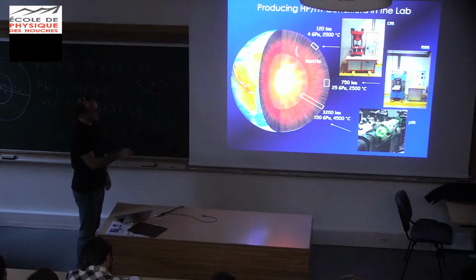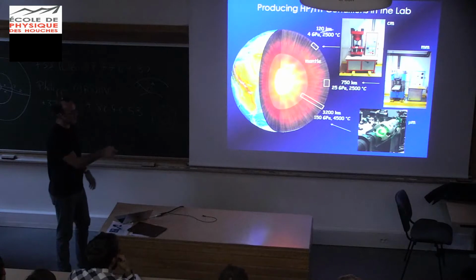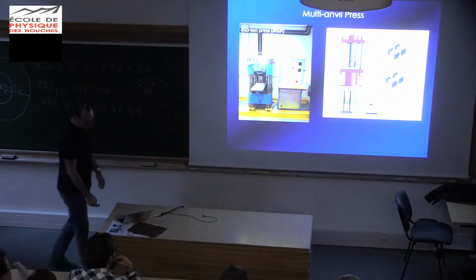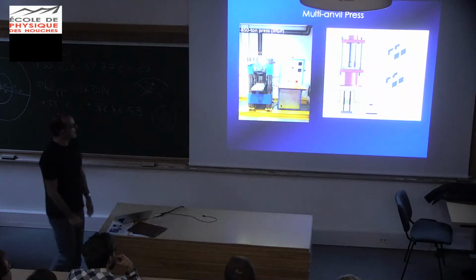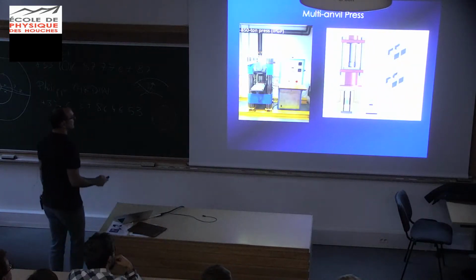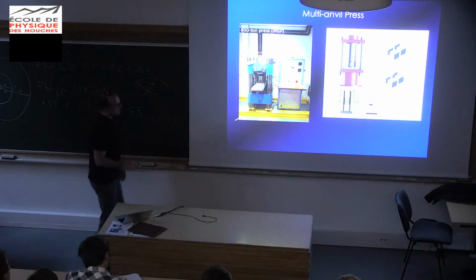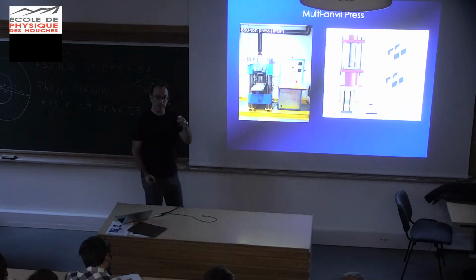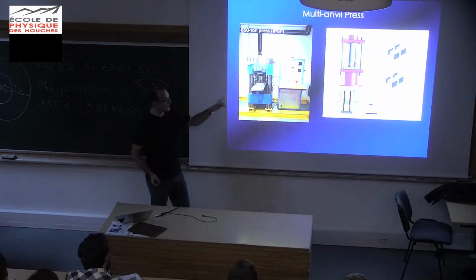So, for the lithosphere, I have colleagues working on the core of the moon. That's a perfect tool. You want higher pressures, you have to move to a more sophisticated workhorse. So why is this machine called a multi-anvil? In principle, it's the exact same thing. And actually in principle it is simpler because you have a single ram, whereas the other one had a double ram. This one has a single ram.